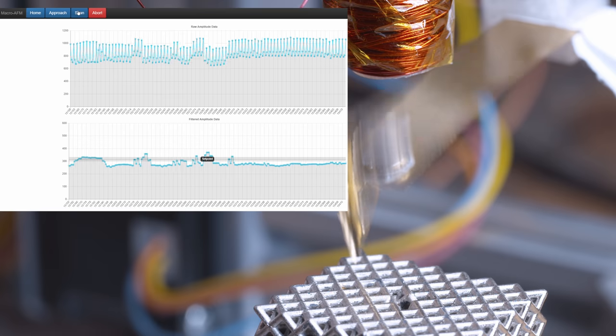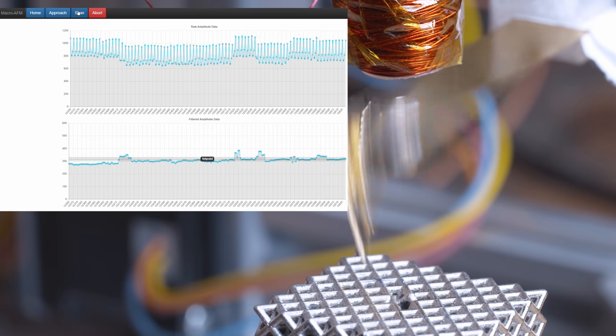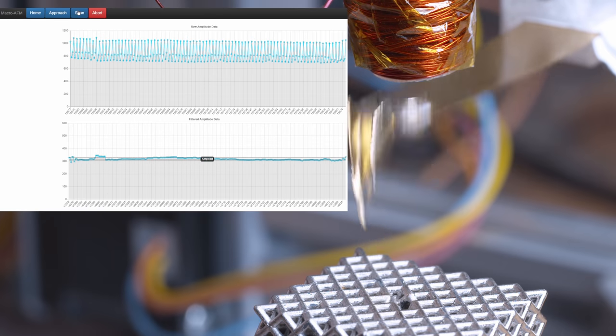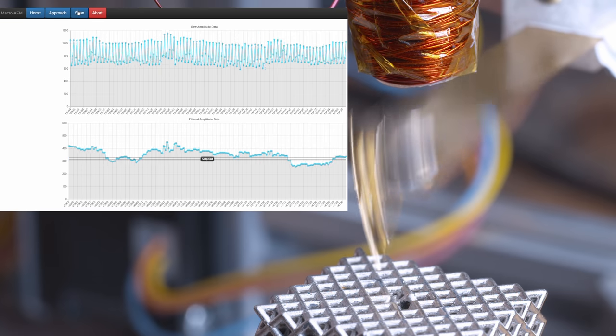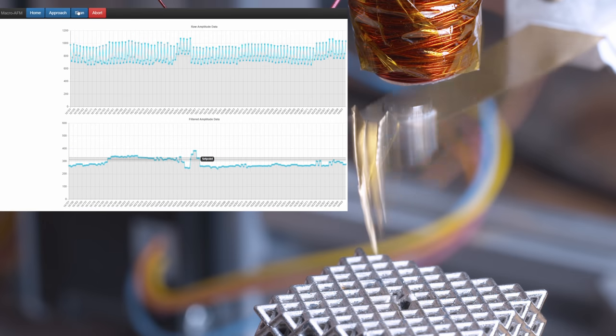We'll move over to the corner of the scan and start rastering across the sample. The chart is always trying to get back to the set point region as defined by those two bars — plus or minus 4% of the set point. The way it works is it moves to the next XY position, checks if it's within tolerance of the set point, then moves up or down as needed. When it finally gets back within tolerance, it records that Z location and moves on to the next spot.